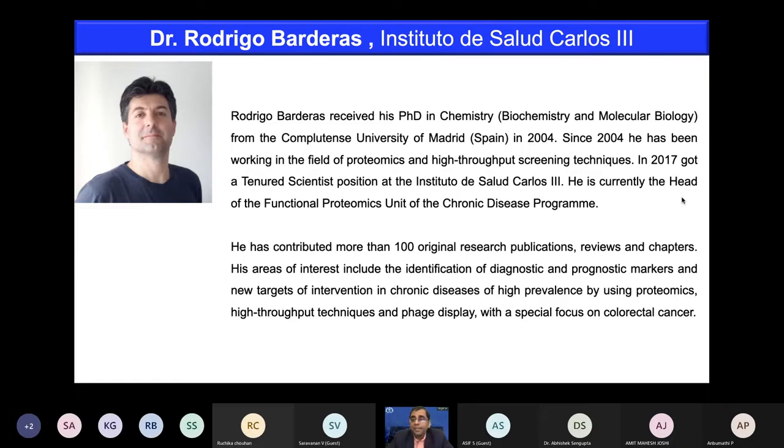And here what we are talking about is essentially protein microarrays, because our aim is to look at how protein functions can be understood in miniaturized forms on the microarrays. So that's where I think Dr. Rodrigo's talk is going to be very interesting, when he is also going to give you some flavor of a new technology which is known as phage display based protein arrays. And of course he will cover some aspects of the printing and how to do quality checks on the protein arrays, and then you can take some of the applications.